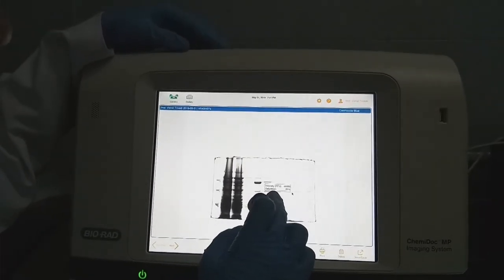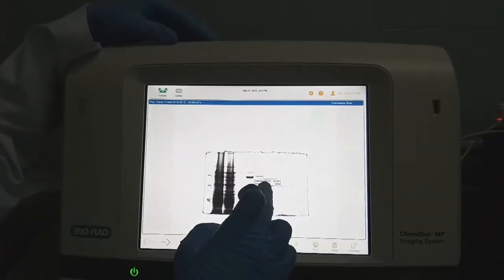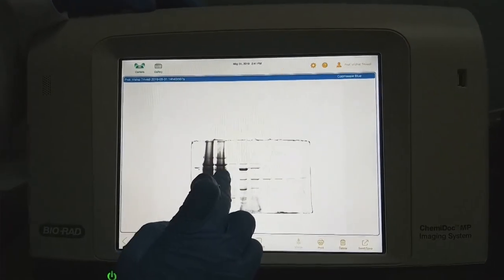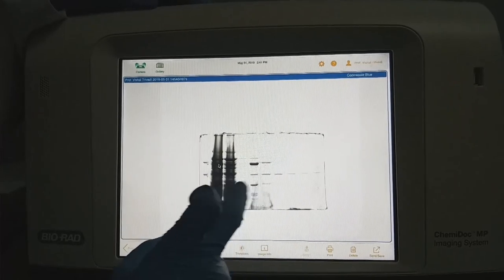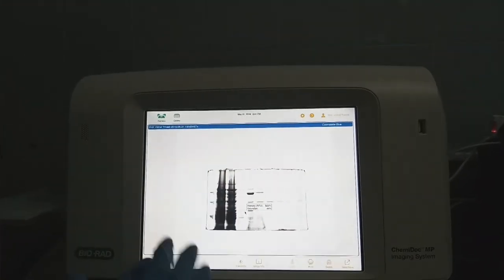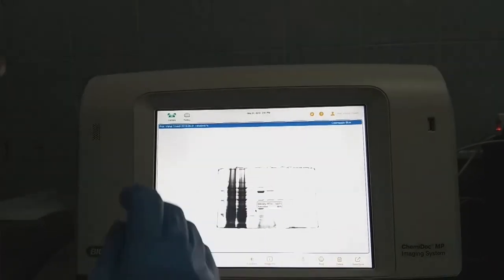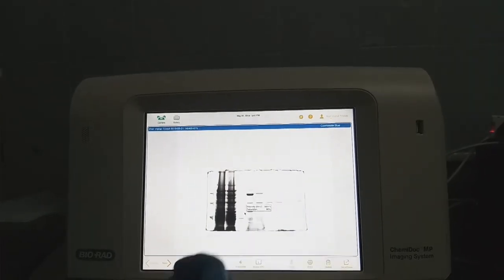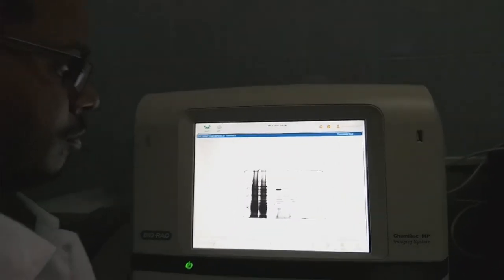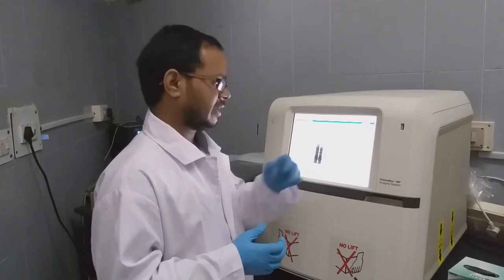As we can see, for the protein corresponding to this His-tagged purification, most of the fraction is going in the flow through. So as I said in the video earlier, we can use this flow through again for purification of the protein. You can incubate this flow through with the same beads and you can repurify again. So that will increase the productivity of getting the protein.